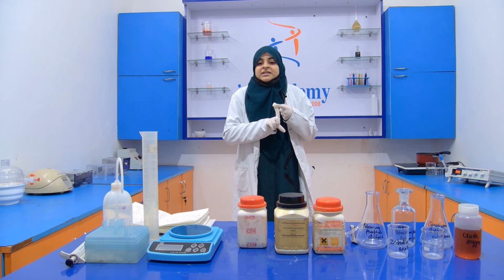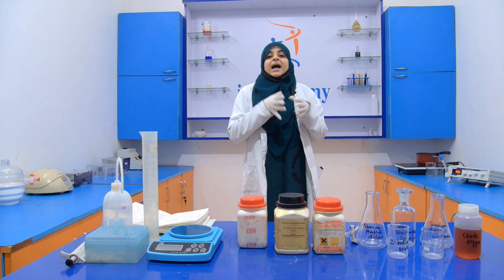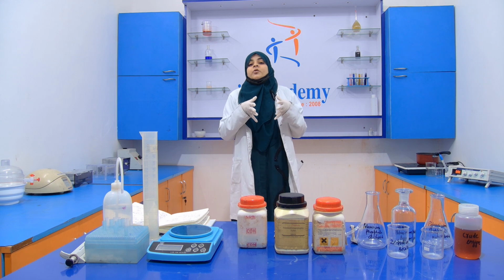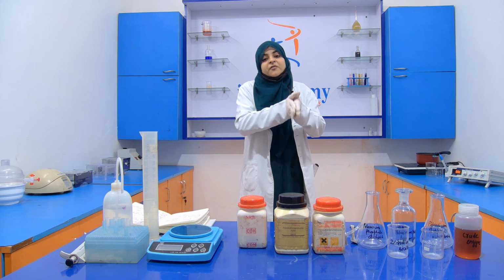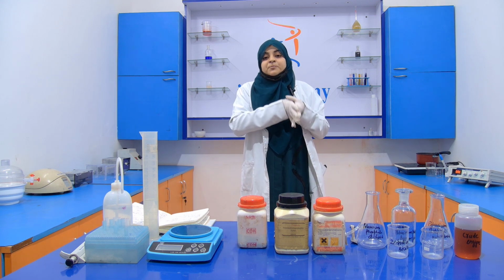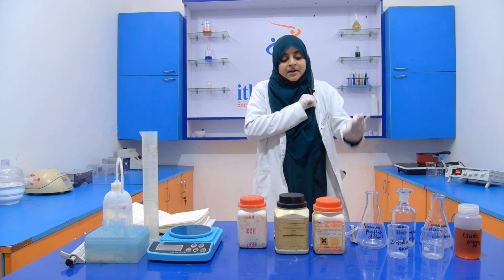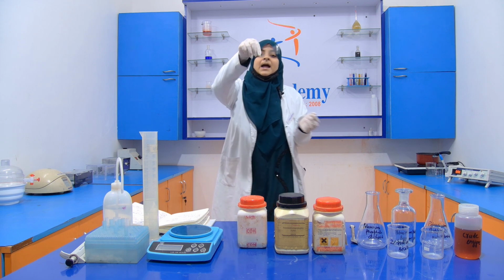Also, it is used for the production of antibodies. That's why the purification of the protein is very important. And the last point is that these proteins are used in assays, so that's why we require the purification of the protein. Here the purification of the protein is done by a membrane called a dialysis membrane.